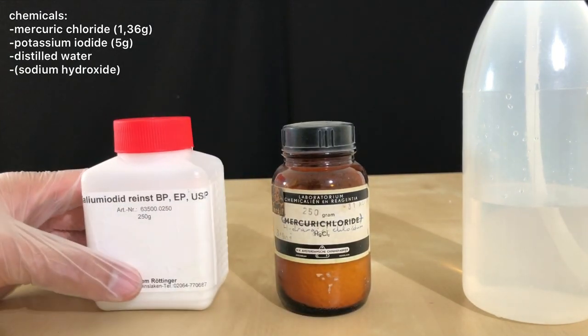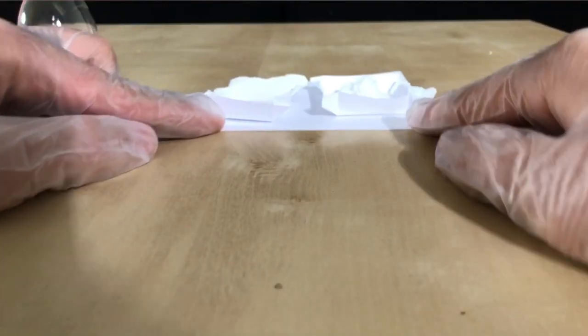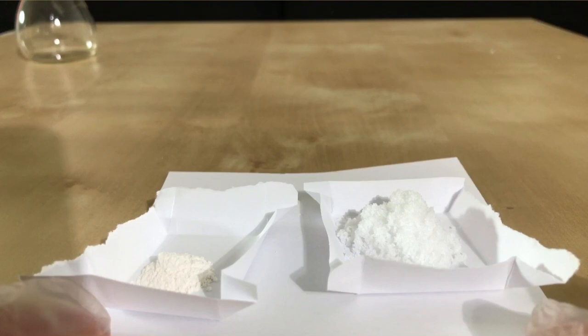Distilled water, 1.36 grams of highly toxic mercuric chloride and 5 grams of potassium iodide will be needed.